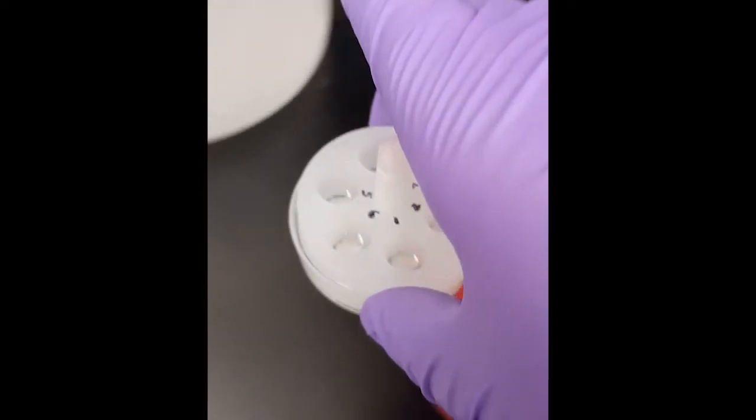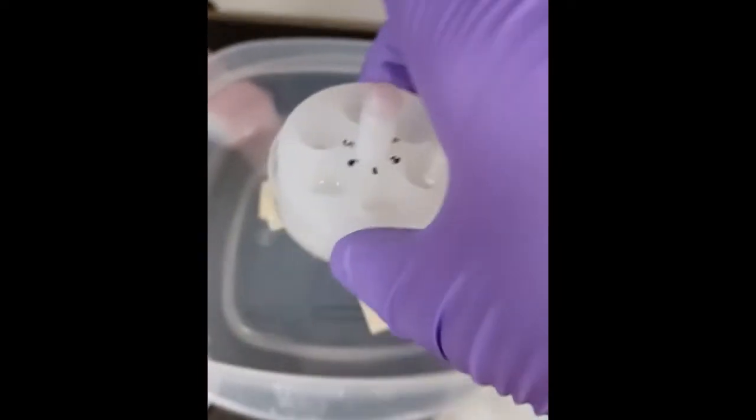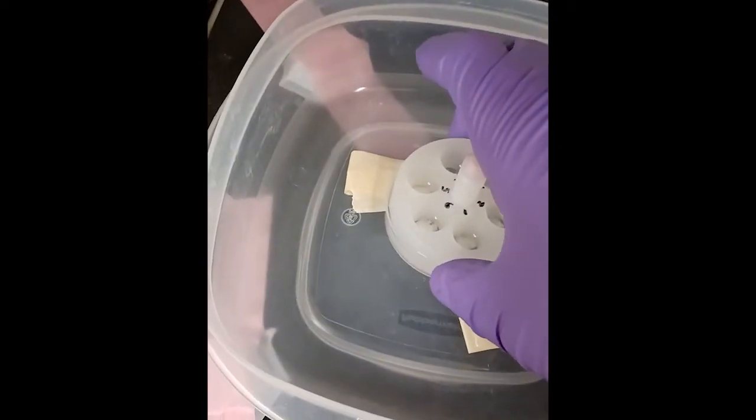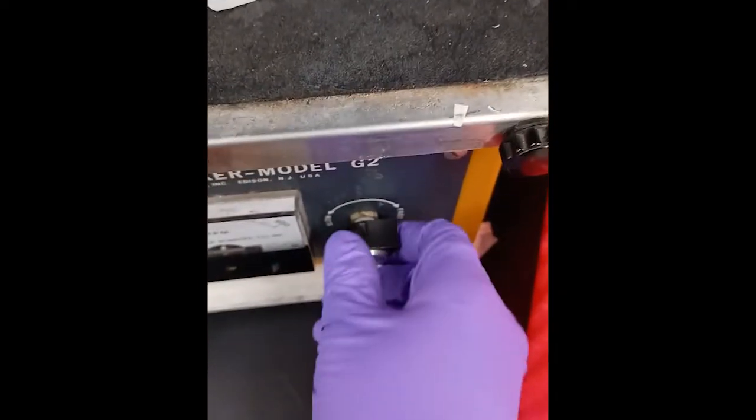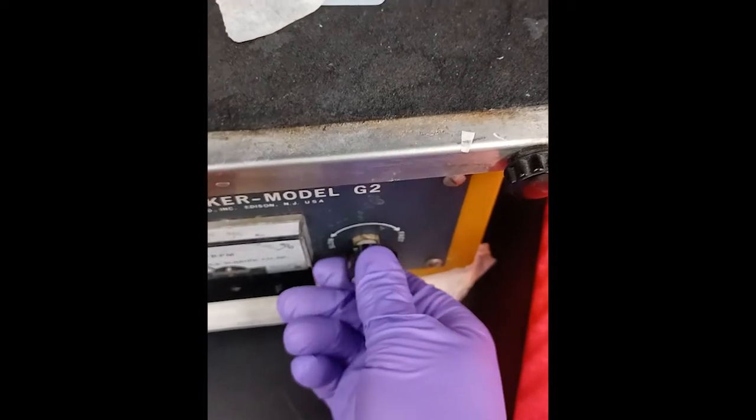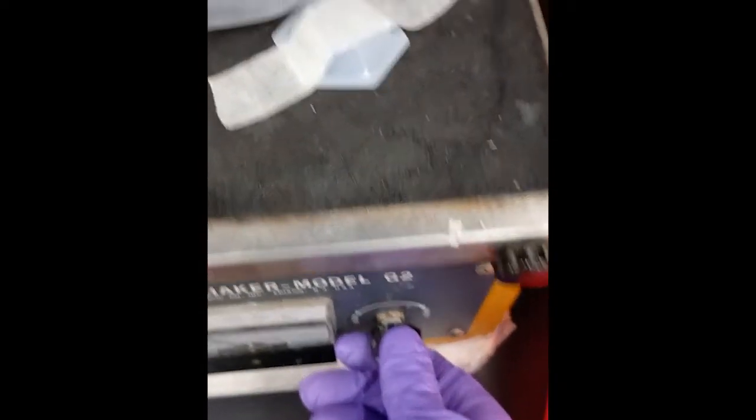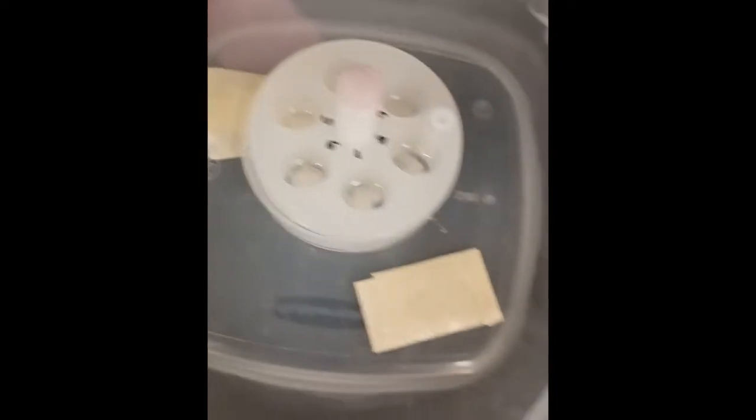Once all three netwells have PBS solution and the inserts put back in, move them back to the Tupperware container that is on top of the shaker as shown here. Set the shaker speed dial to just fast enough so that you can see the sections moving slightly. It is best if the sections move slowly.